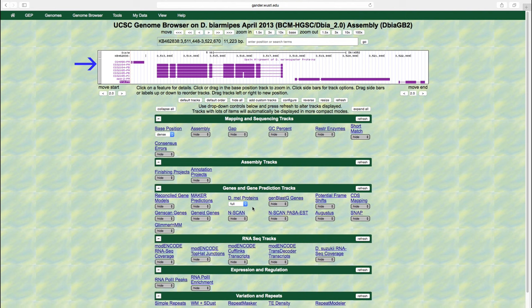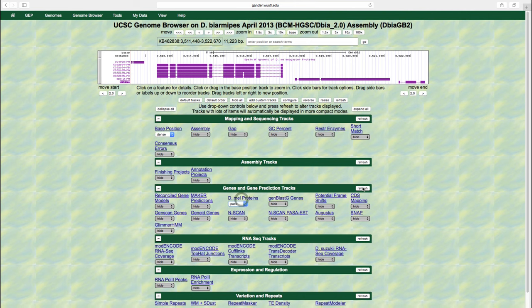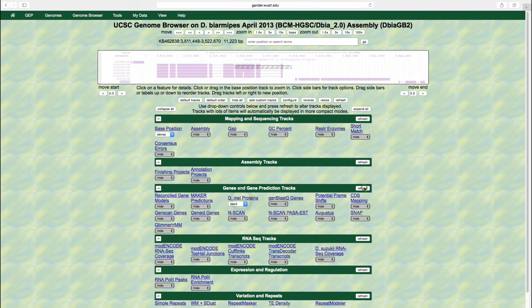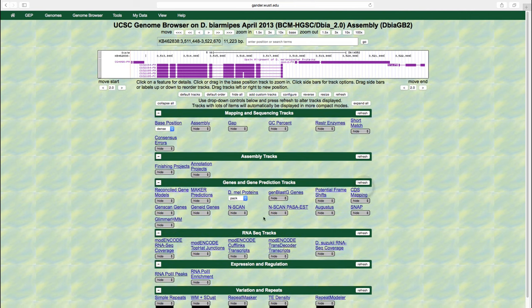To reduce the height of the genome browser image, we can change the display mode for the DML proteins track to pack. In pack mode, the track is displayed with each annotation feature shown separately and labeled, but overlapping features are shown on separate lines. Hence, this display mode offers a good compromise between the dense and full display modes.